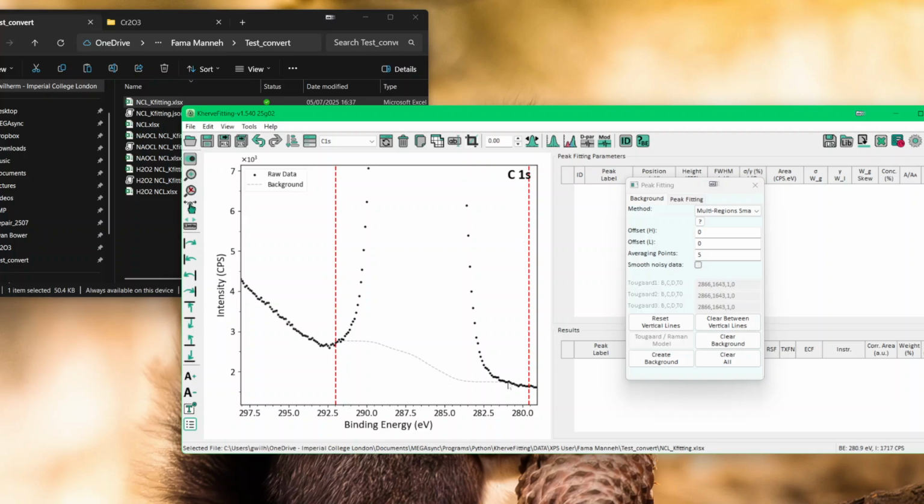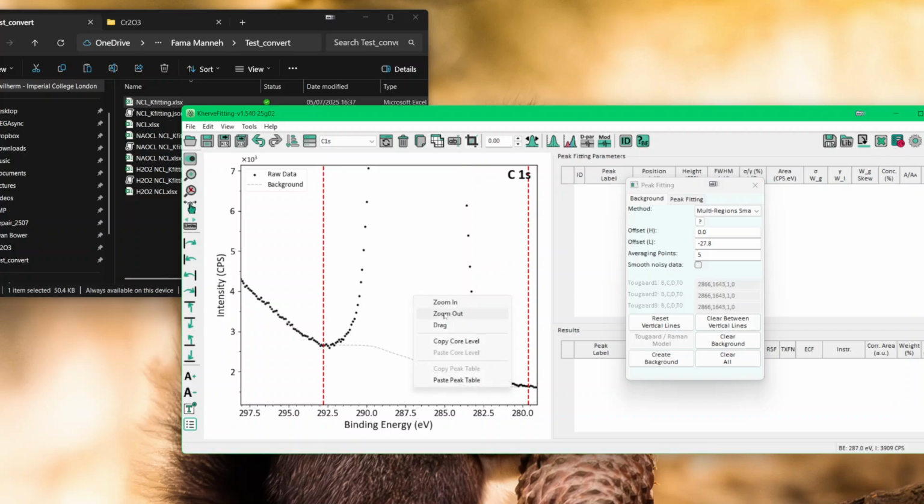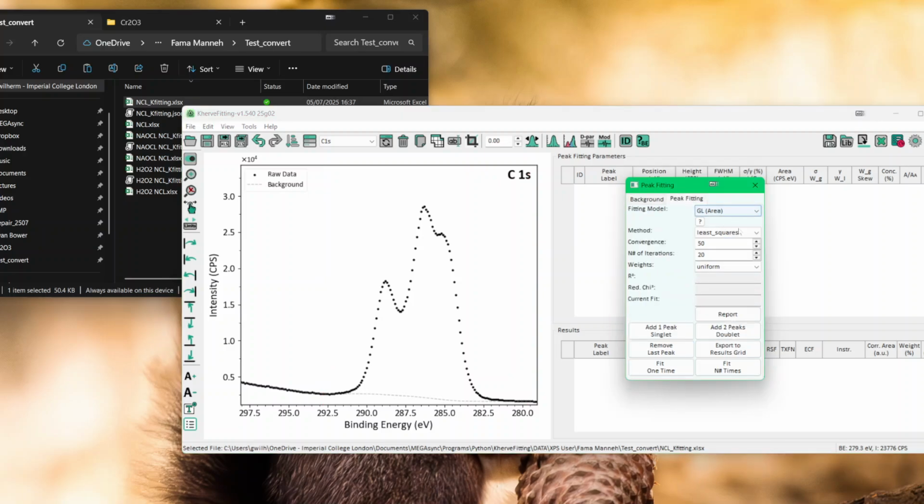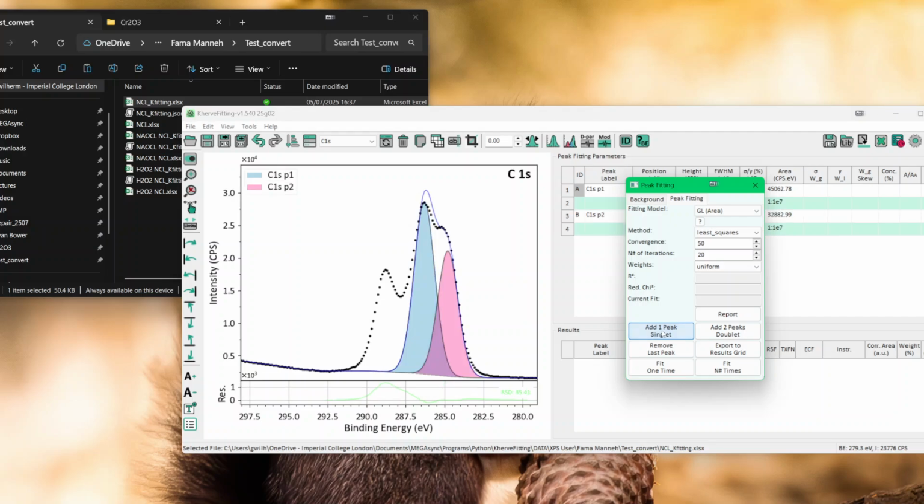This is the one I use, where now this is using the LM-Fit XPS. And you can't go higher than the data, and it will not diverge, so it will be better for noisy data. So let's say this is my data. Maybe let me just move that somewhere here, and I will create some GL data, very quickly.